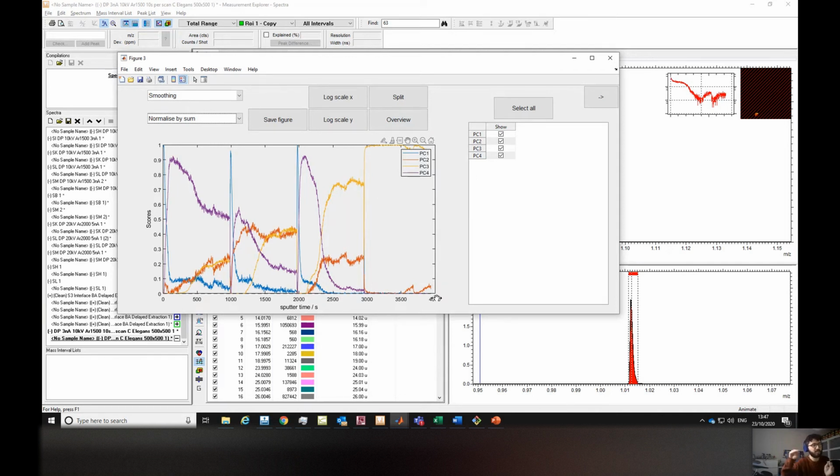So it will be constant, right? It will just be the same. Yeah. And you can kind of judge it as a fake profile, which is not showing any etching or anything, but it's being added to your matrix to help you find solutions. Obviously it's not designed for this, it's designed for comparing profiles. So basically you're just adding repeat rows in the matrix, but still it helps in the statistics, right? Because each scan will be slightly different, so you have this variation. So yeah, I think it's a really good idea.